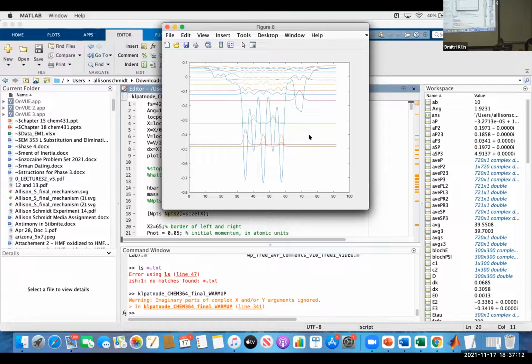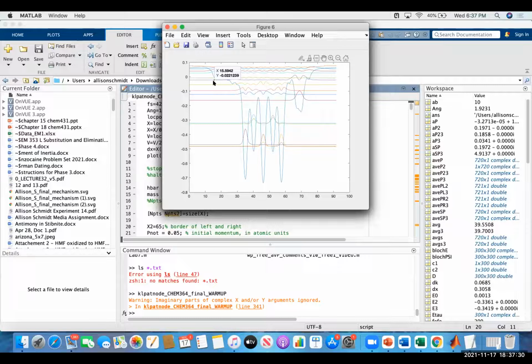Correct, absolutely perfect, yes. And the little feature at around x equals 15, can you move up? Yes, it is a dye that either donates electrons or soaks up the holes. Instead of the typical two-component layers for a dye-sensitized solar cell, here there are three components. Light is absorbed in the central photoactive semiconductor, lead halide perovskite, and then the electron goes to titanium dioxide, and the hole goes to the dye. Yeah, it's really interesting.